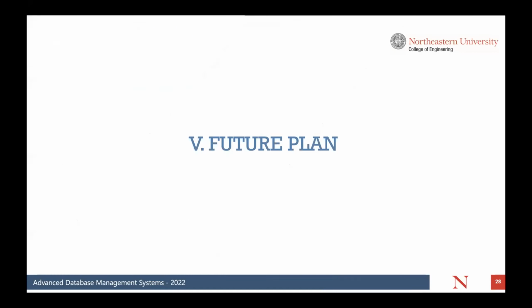Next is our future plan. For our group, hospital biosample storage and management is a very meaningful topic. So we hope to improve the system in the future. For example, for the data source, we use a CSV file. So when we add some new data, we need to update the file. But in the real world, it's not very convenient to update the file every time. So maybe we can add a front end or some other techniques to improve this.